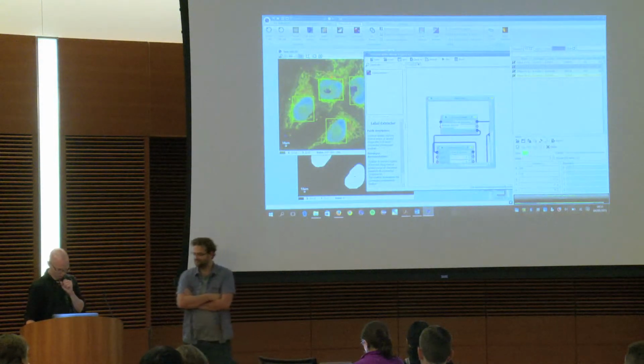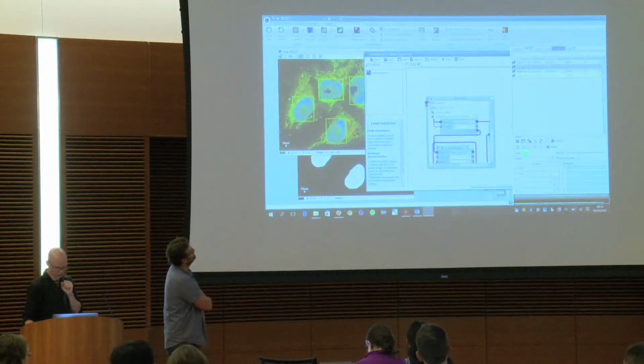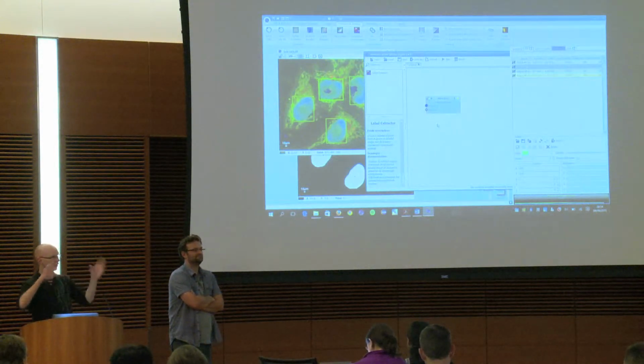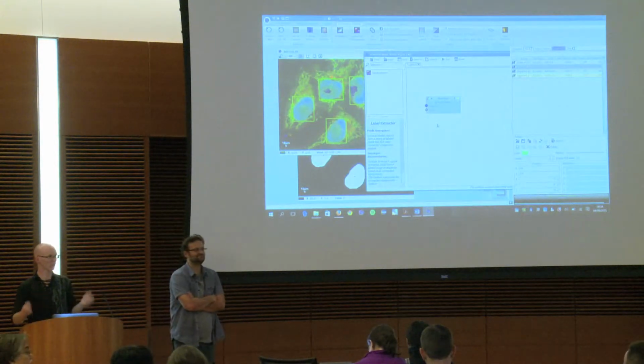But you can also expose a variable this way. And then when you collapse it, you have a sort of new block which does a complex processing. And so you can use different complex blocks this way to build more complex protocols.